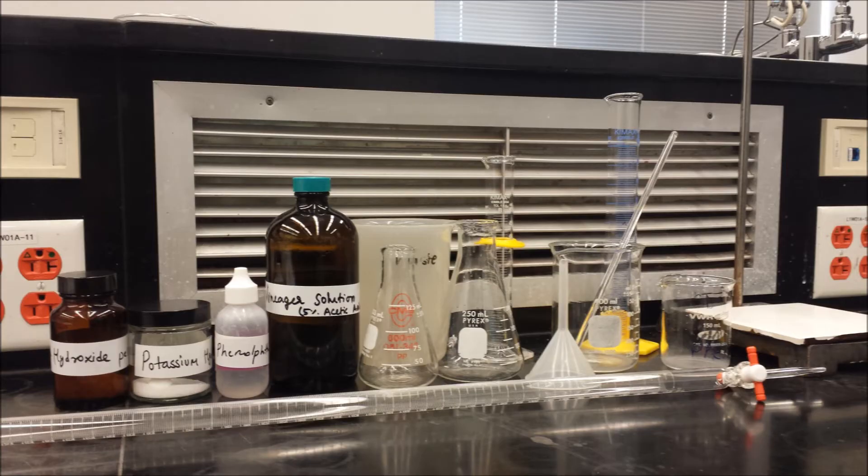Here are the materials you will be using throughout the experiment: a ring stand with a clamp, a white tile, a burette, a funnel, graduated cylinders, a stirring rod, a 150ml and 250ml Erlenmeyer flask, a 150ml and 400ml beaker, sodium hydroxide, potassium hydrogen phthalate, phenolphthalein, vinegar, and a waste bucket.